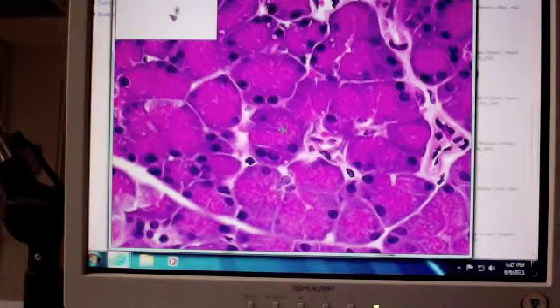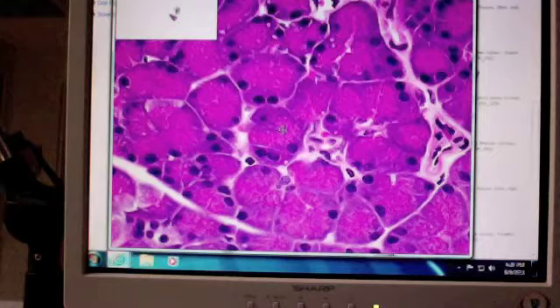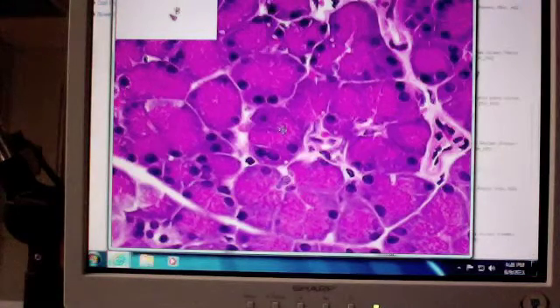Whereas these guys, what kind of secretion are they going to do? Merocrine, okay? Because they're not pinching off the top of the apices. Do we remember which one we gave an example of apocrine? It was a special kind of sweat gland where the whole plasma membrane gets pinched off at the top. The stinky ones, yes. Did we already look at a sebaceous gland so far? We have. Do you want me to go back and look at it again? Is that the hair follicle one? That's the hair follicle one. Yep.